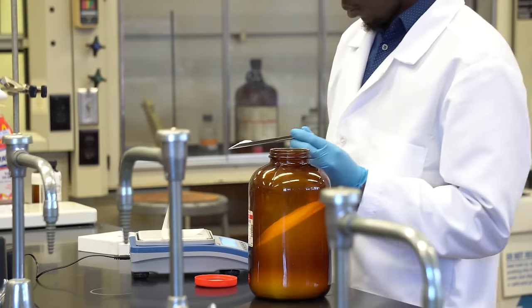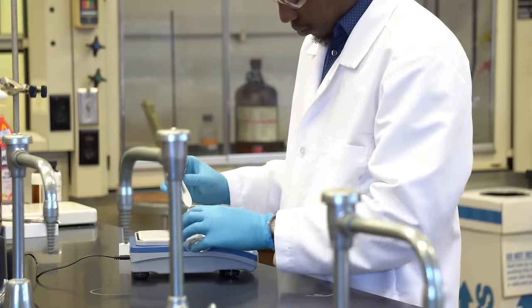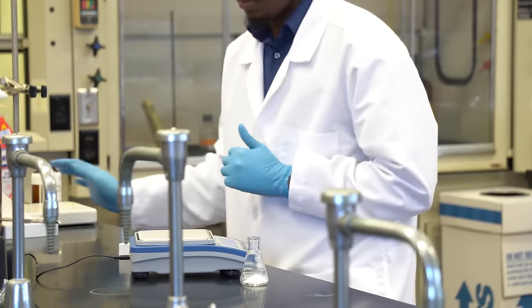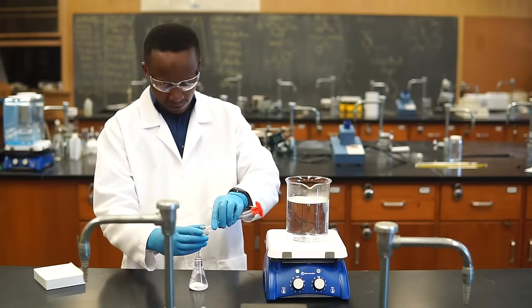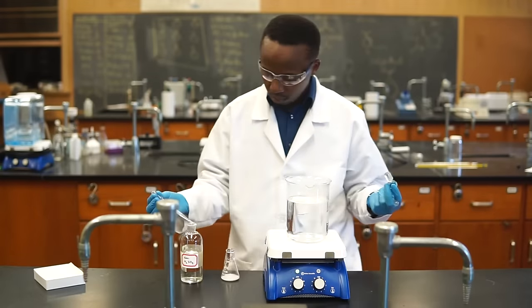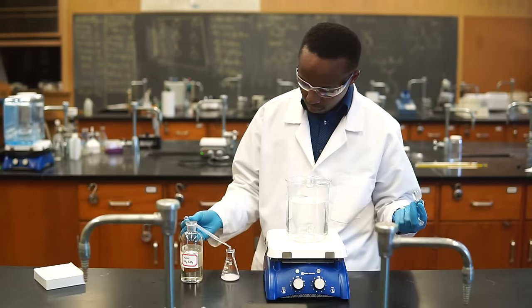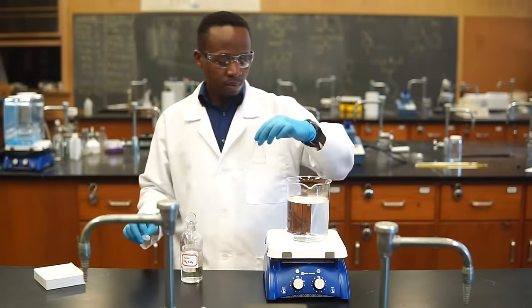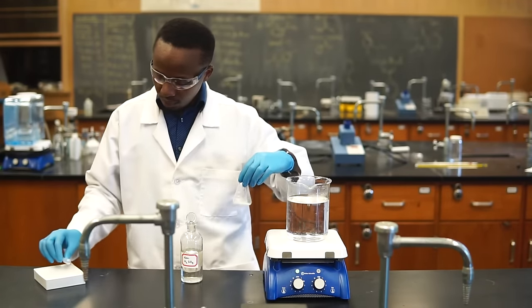We'll put about 2 grams of salicylic acid in a 125ml Erlenmeyer flask, making sure to record the precise mass on our datasheet. Let's add 5ml of acetic anhydride to the powder. Let's also add 5 drops of concentrated sulfuric acid. Swirl the mixture to make sure that everything is well mixed.